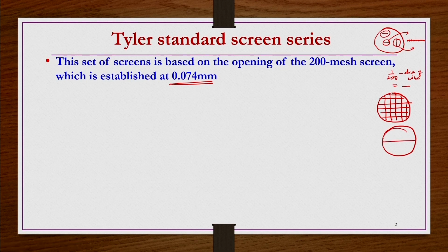So, here also you have this screen opening, let us say like this. Let us say this is 10 mesh, and then let us say this is 14 mesh.